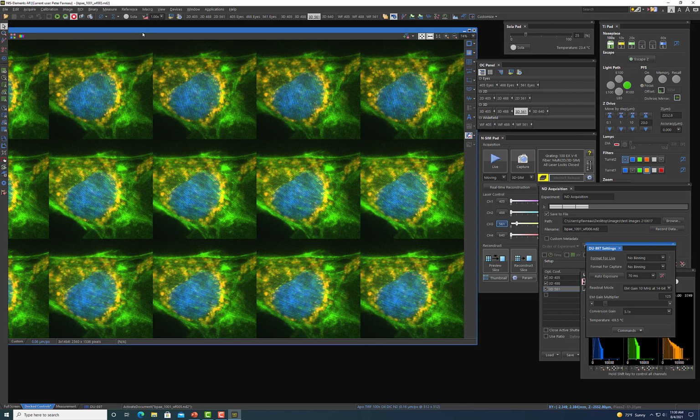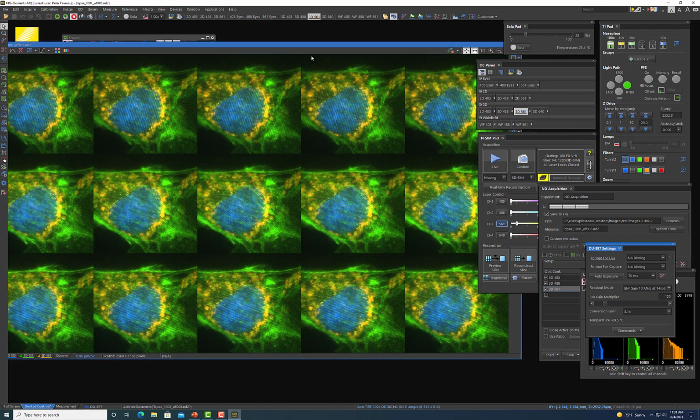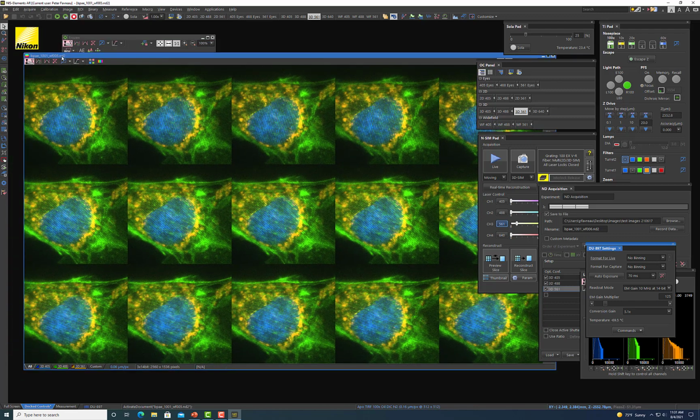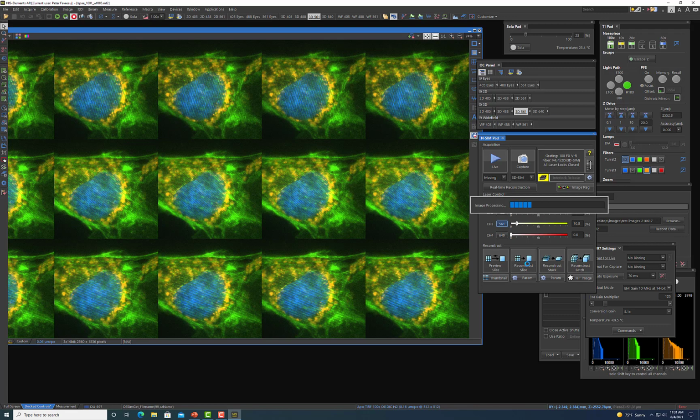Now what we can do is we can do the reconstruction here on this workstation. So as long as you have this set of 15 images, this ND2 file, this is what you're going to be ultimately using for reconstruction from then on. So if your time is short, you can just acquire the images and do the reconstruction later. But as I said, I just want to show you real quick before I go today how to do simple reconstruction. So I'm just going to hit Reconstruct Slice.